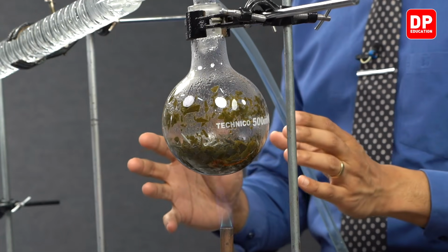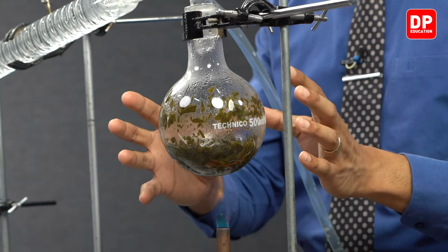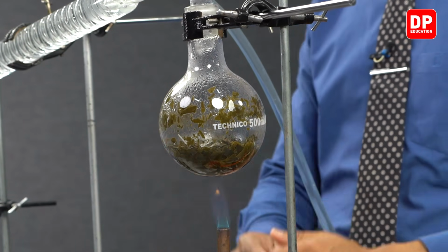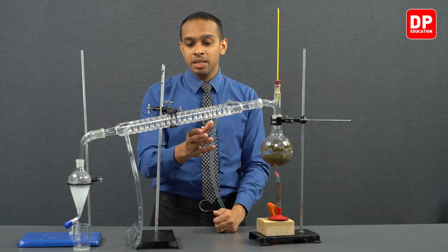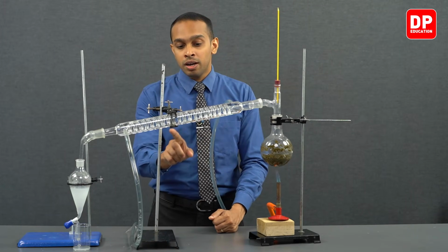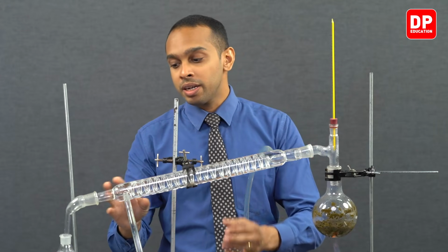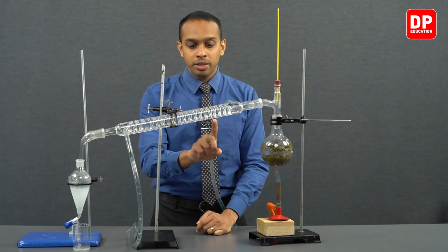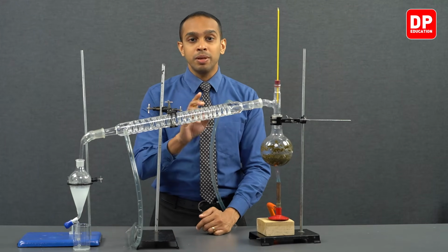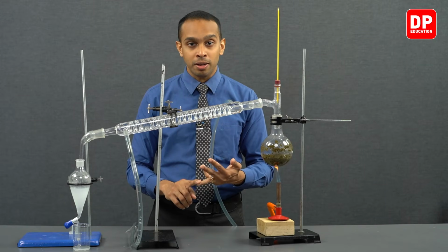However, after we observe that most of the water has evaporated, we are going to stop heating this mixture, and the remaining liquid in the condenser will be collected into our separatory funnel. The liquid that you see over here is a mixture of water and the essential oil.